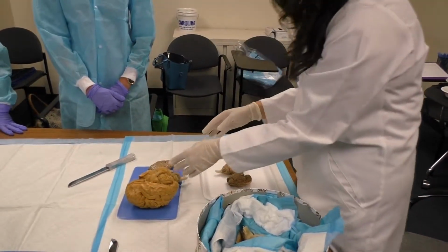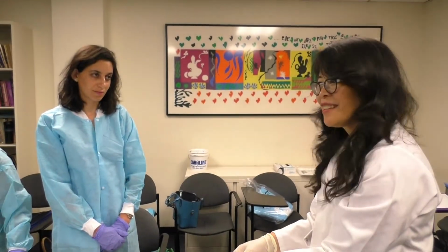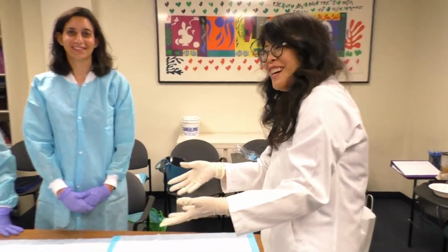And that houses two of your favorite structures that I heard you talk about, the hippocampus and the amygdala. What was your favorite structure? What did I pick? I picked the whole temporal lobe. Oh, well, see, you're all temporal lobe centric.